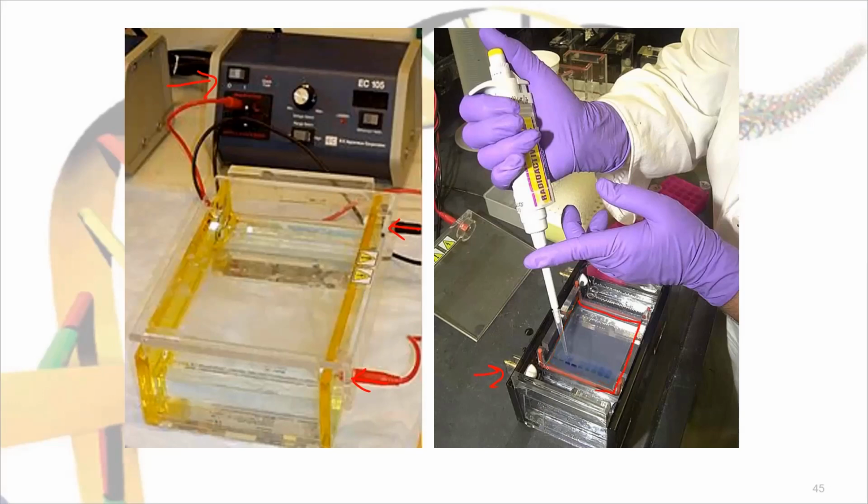Okay, and you can see within the gel slab these regions. This is where the DNA is being loaded. This is called a micro pipette. You have seen a pipette in your chemistry lab. This can hold a very small amount, like a few micro mLs.